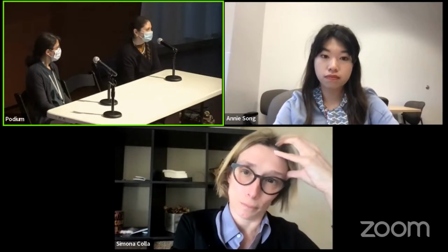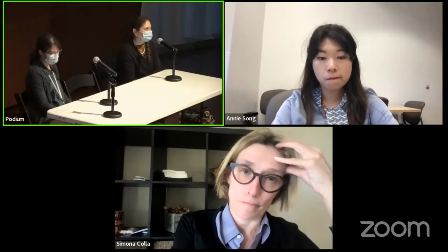Yeah, and this is a big problem with multiome. So multiome is doing ATAC and single cell RNA-seq, so you're having to go after nuclei and whole cell. A lot of the tech dev on this is dissociating nuclei from tissues that look good. And so there are many iterative rounds of dissociating tissue, looking at them under microscopes, seeing how much debris to nuclei I have, and whether that is going to work.